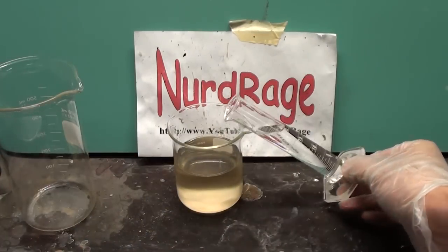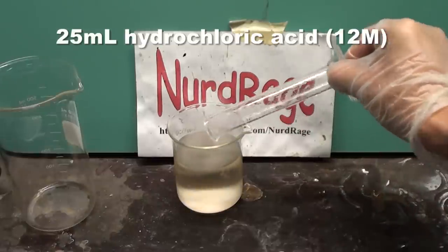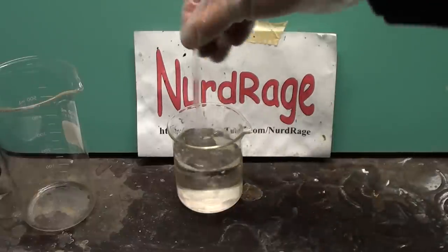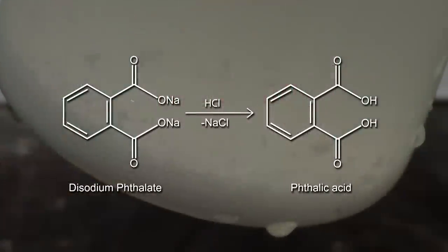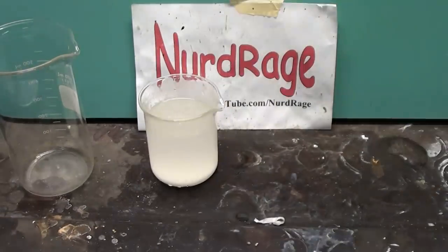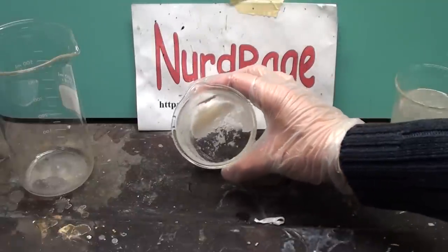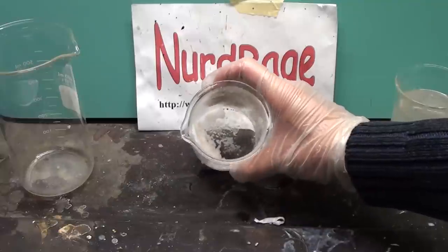Now with the disodium phthalate solution, add to it 25mL of concentrated 12 molar hydrochloric acid, also known as muriatic acid. Stir the solution and put it into the refrigerator or an ice bath to cool. The reaction of disodium phthalate with hydrochloric acid produces sodium chloride and phthalic acid. Since phthalic acid has low solubility in cold water, it will eventually precipitate out. Pour off the excess liquid. This phthalic acid is impure and we want phthalic anhydride, so we're going to purify and convert it to phthalic anhydride by distillation.